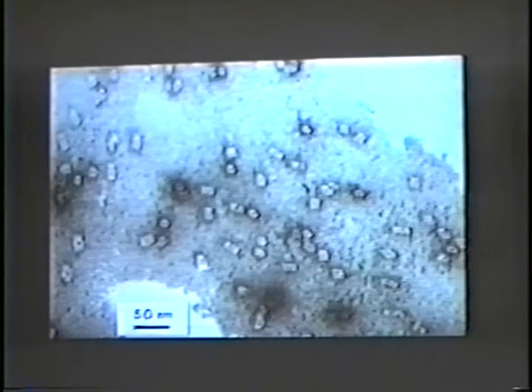Here we have an example of mobility of the carbon support film. If you look closely at some of the cylindrin molecules, you'll see possible compression and extension of the molecule due to the mobility of this very thin carbon film within the electron beam.